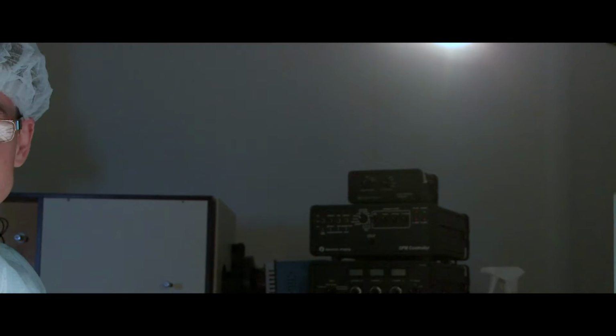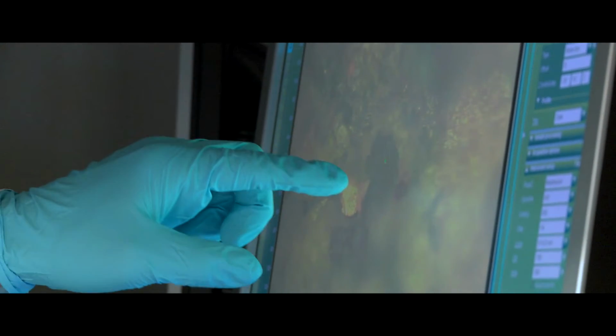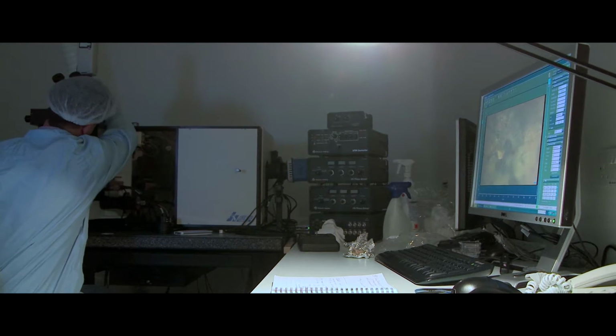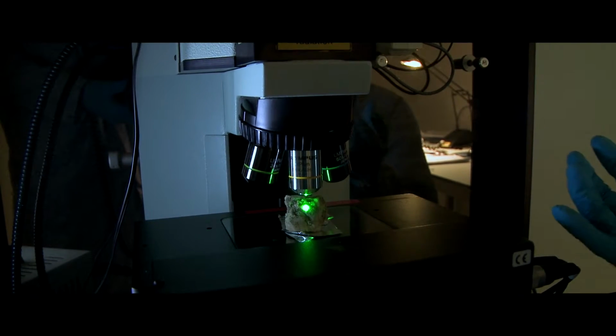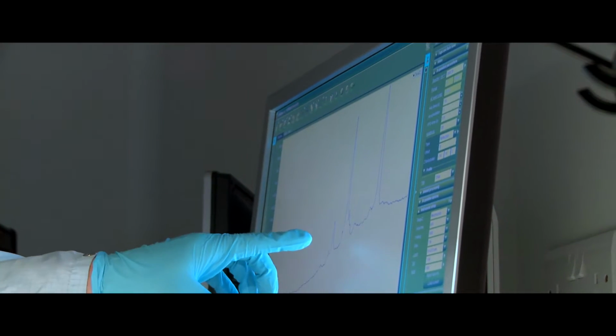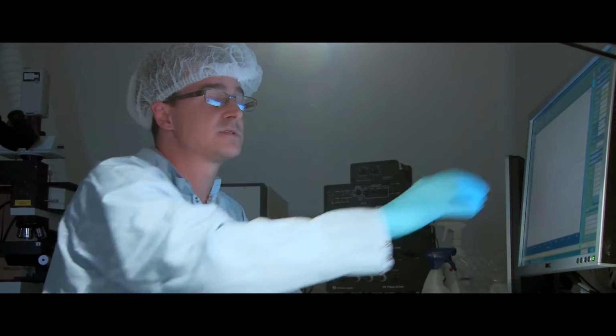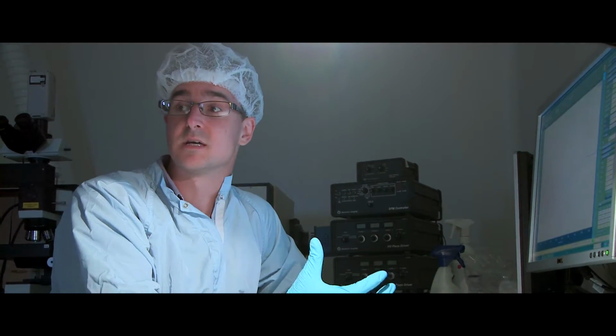But if instead we target some of that green colour, this is the microscope view that we're looking at right now of the underside of that quartz rock, showing a clump of green. This is a colonization patch of the cyanobacteria. And if we turn off that microscope view and put it to the laser beam for the Raman spectroscopy, instead of seeing the spectrum of the quartz rock, we see the spectrum of the cyanobacteria themselves, and particularly this triplet of peaks. This is the fingerprint, this is the spectral signature of carotenoids inside the cyanobacteria.